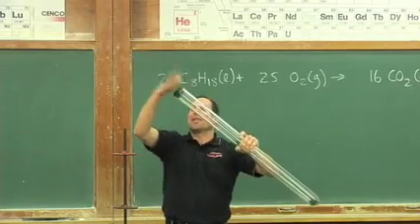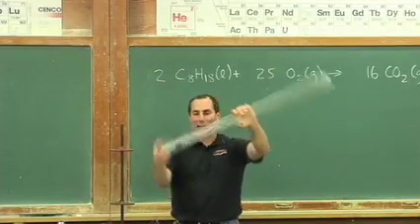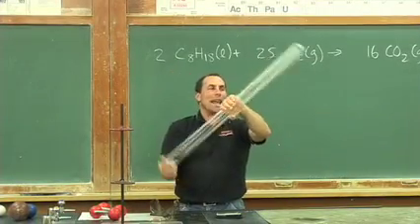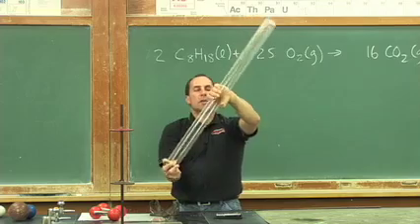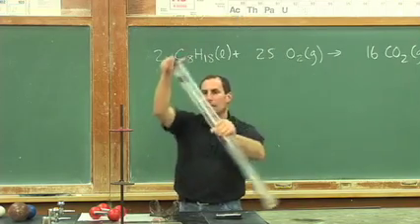Now I'm going to put a rubber stopper on the top of this for a moment and bounce this little rubber stopper back and forth. I'm acting like a carburetor. I'm mixing the fuel in the air and there's no more liquid left. It's vaporized. It's all in the gas phase and hopefully nicely mixed.